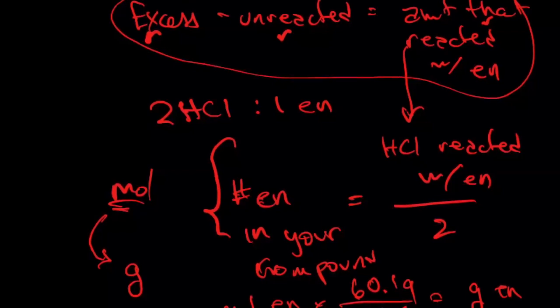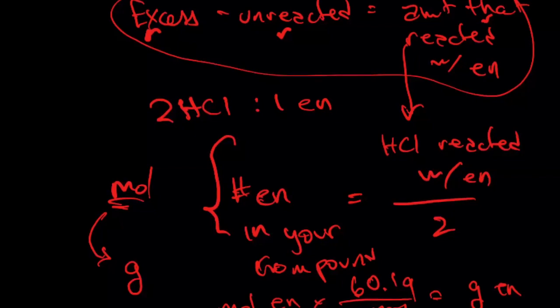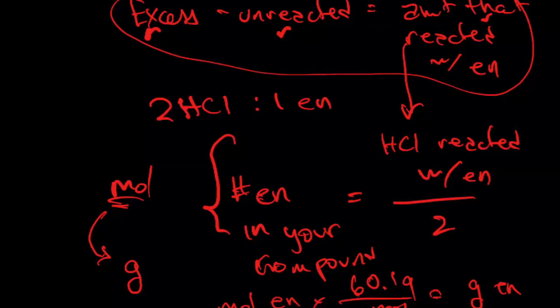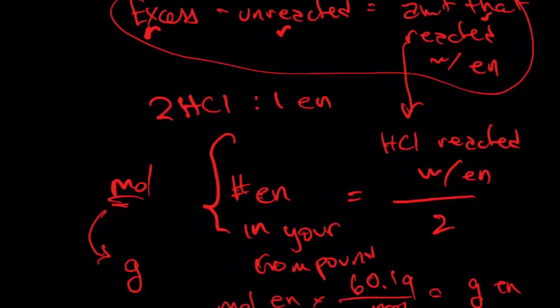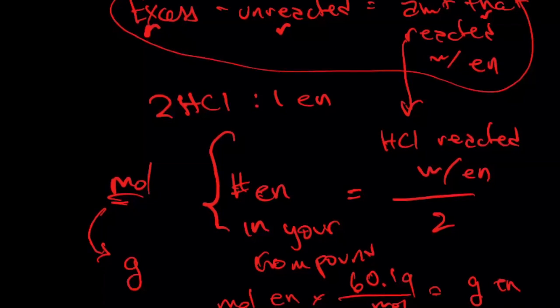You put in 10 mils of hydrochloric acid at a concentration of 0.1944, which tells you the moles. Part of that hydrochloric acid reacts with ethylene diamine. Part of it did not react. They were in excess, okay? What you did was you titrated that excess. That's why it's called a back titration with sodium hydroxide, and you found the equivalent point.